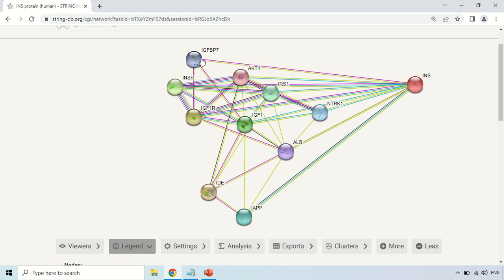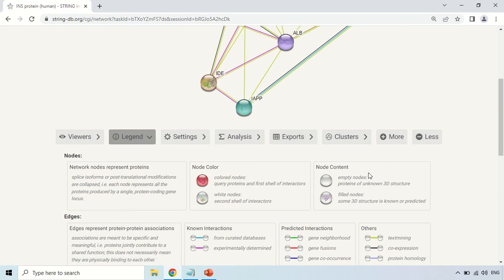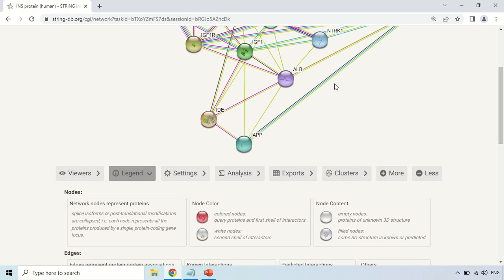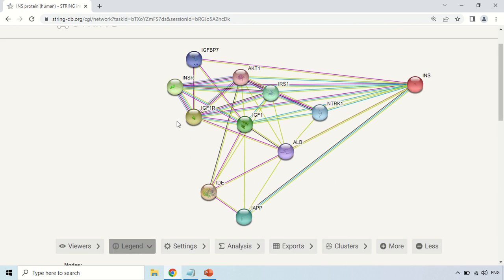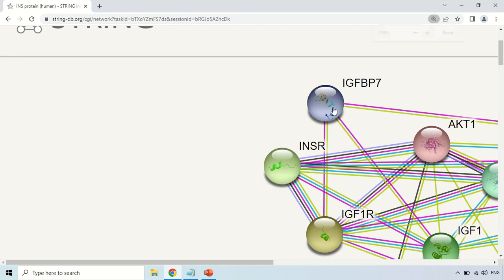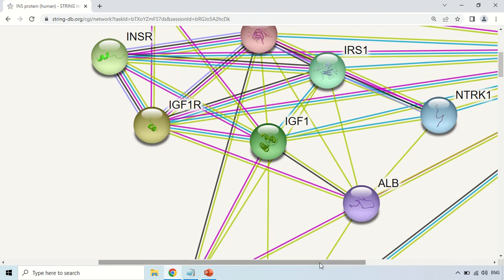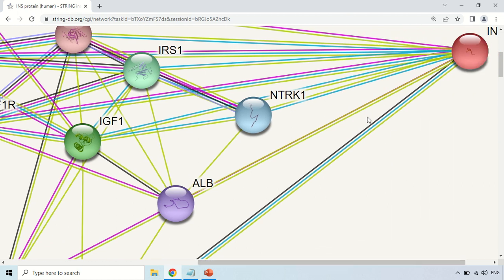Here, nodes in color boxes show the first shell of interaction, and white boxes represent the second shell of interaction. Additionally, if these are empty nodes — meaning no structure is shown inside them — it means the 3D structure of that protein is not known. But if there are structures within these nodes, meaning they are filled nodes, it means some 3D structure is known. You can clearly see structures within certain nodes, meaning the 3D structure of those proteins is available. If they are transparent or white with no structure inside, their 3D structure is not available.